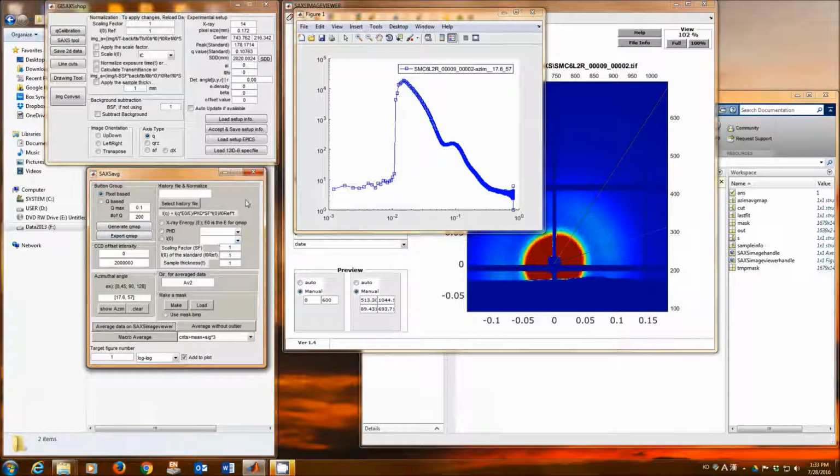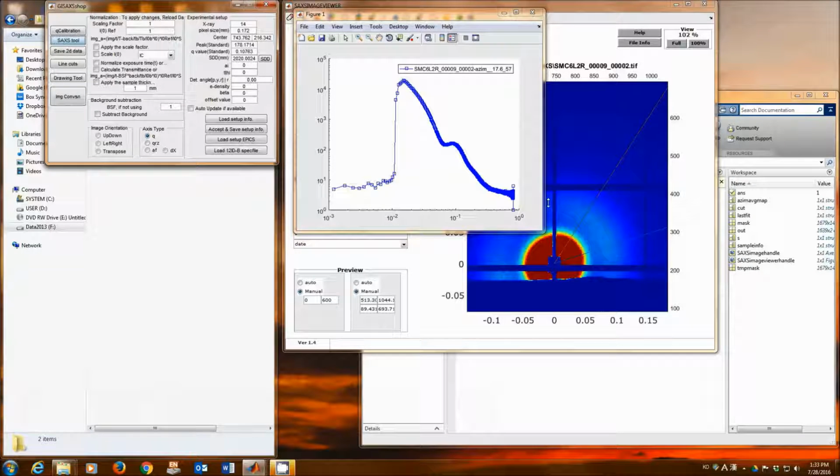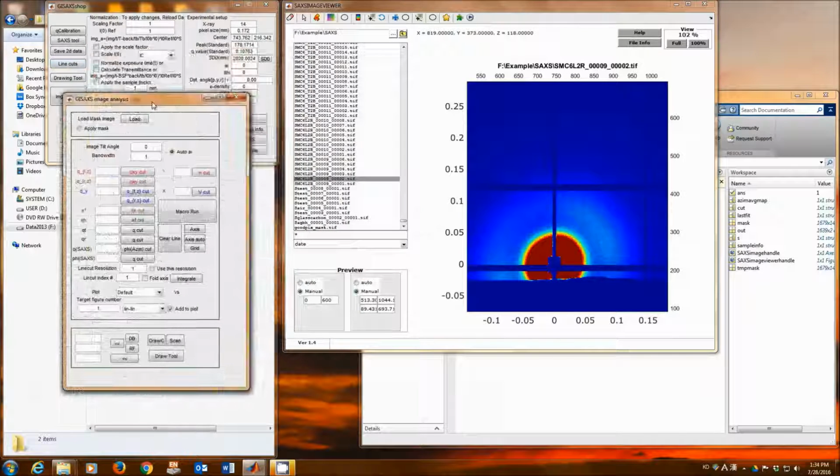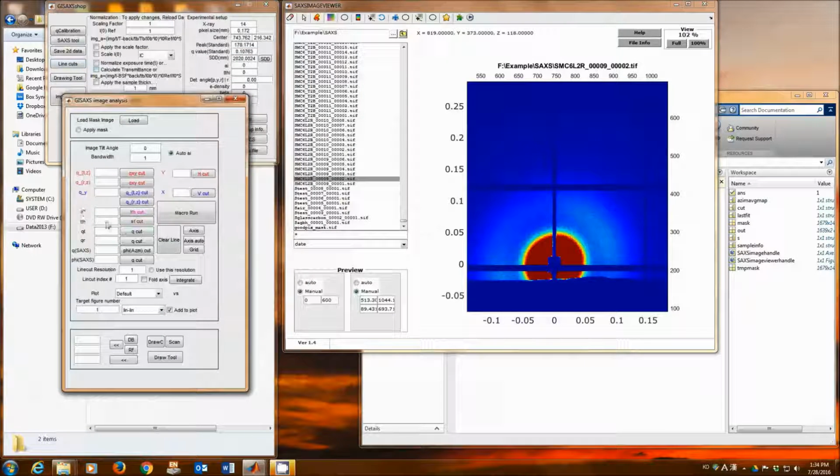And instead of averaging the entire section of the images with azimuthal averaging, you can also do line cuts. If we want to erase these lines, you click this button, eraser, and then it will go away. There's an option like line cut here. There are many things here, but mostly for GSAXS. These two options are for transmission SAXS data. For this one, you can do the phi cut, along the azimuthal direction. And the next one is you can make a Q cut at a given phi angle. Like this.